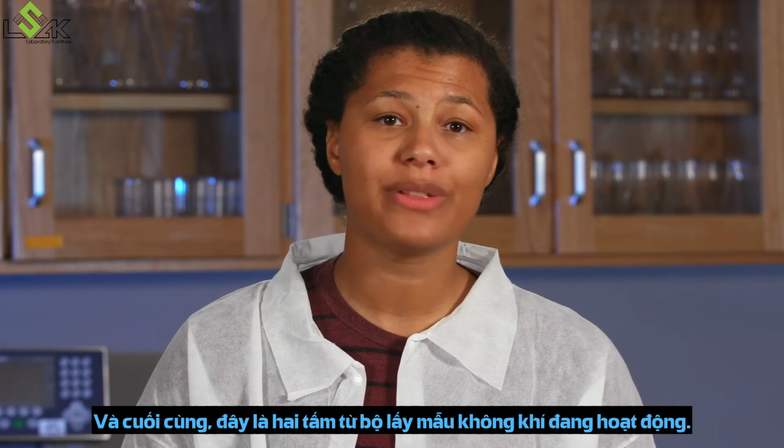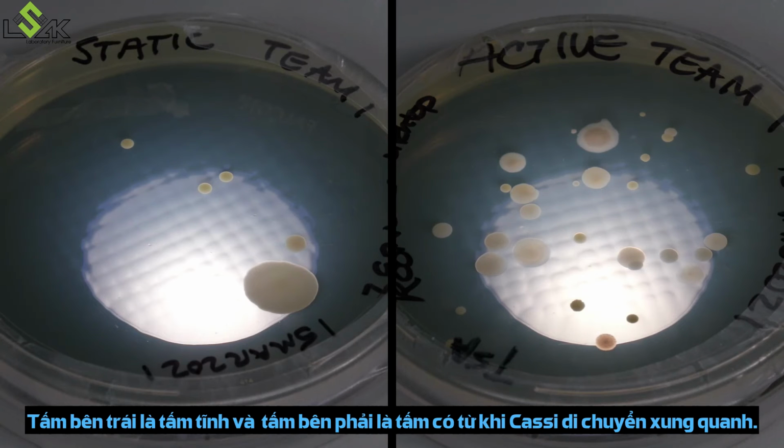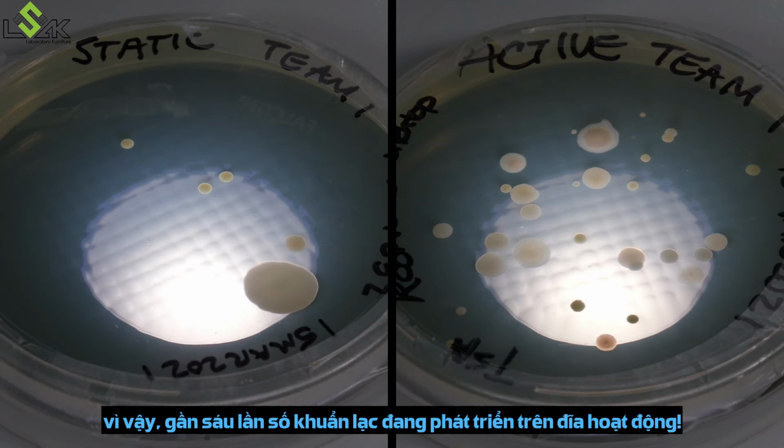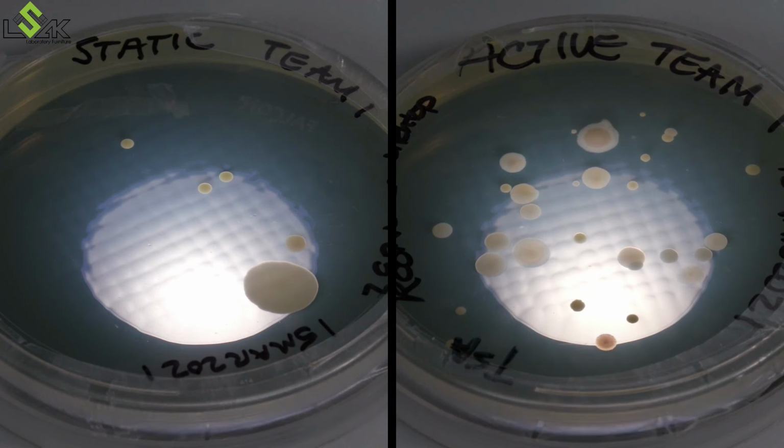And finally, our 2 plates from the active air sampler. The plate on the left is the static one, and the one on the right is from when Cassie was moving around. There are 5 colonies on the static plate, but over 30 on the active. So almost 6 times as many colonies are growing on the active plate.